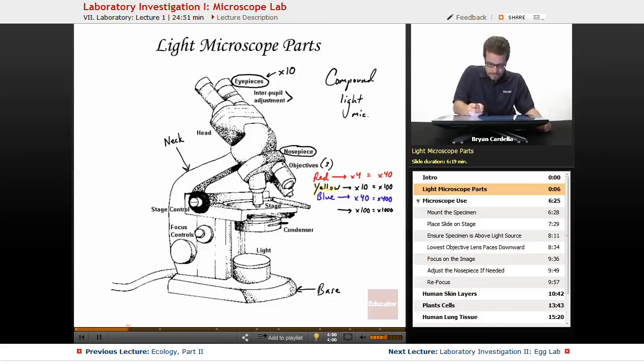A stage. This is where the actual specimen is mounted. Usually there are stage clips, little metal parts that keep the glass slide on the stage. When you rotate some of these focus controls, the stage moves up and down and that allows you to focus the image. The stage control here moves the slide in a horizontal sense on top of the stage so that you can make sure that the precise part of the specimen you want to look at is right above the light source. Usually in the stage in the middle, there is a hole that allows the light when it's turned on to go up through the condenser and into the hole in the stage. So that's why it's a light microscope. You are using light to be able to see it.